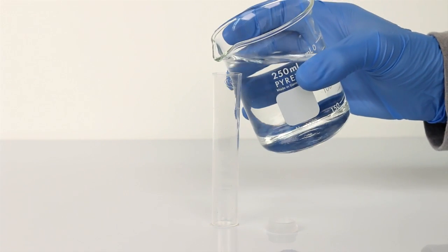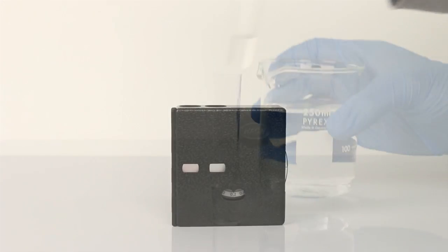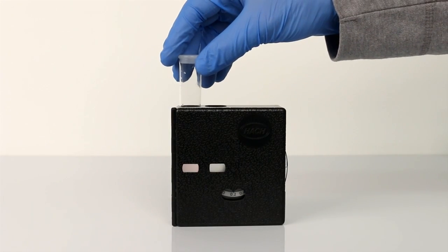Fill the viewing tube to the 5 ml mark with the blank sample. Place the tube in the top left opening of the color comparator.